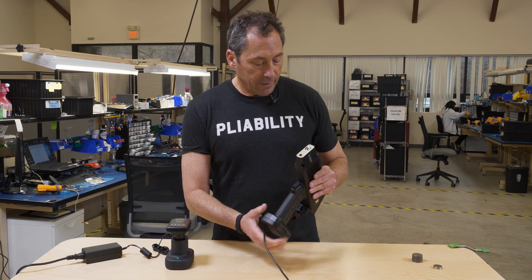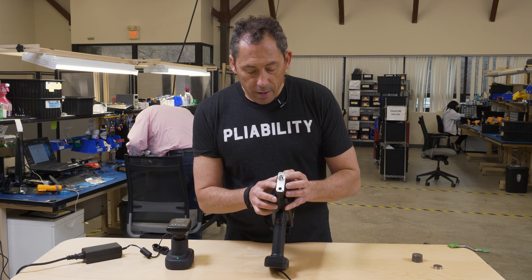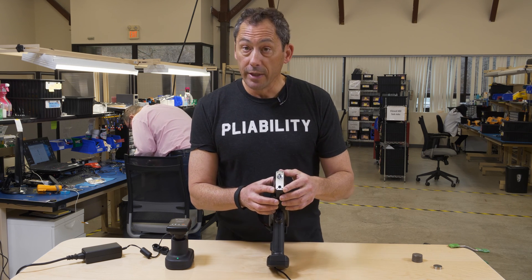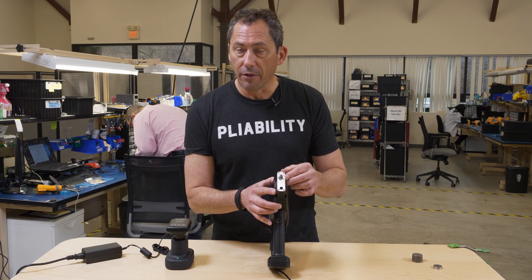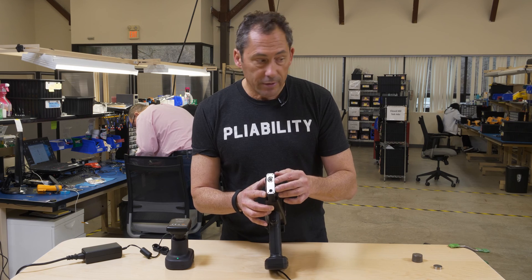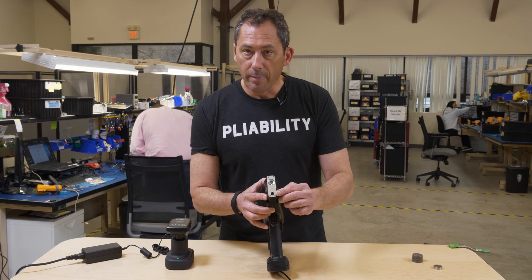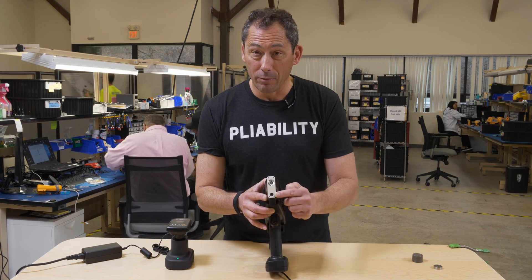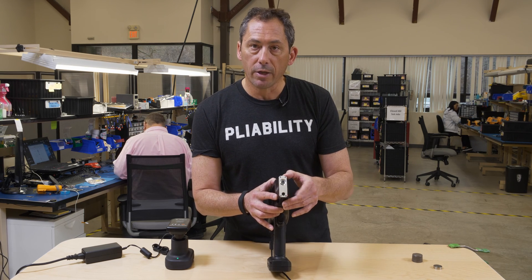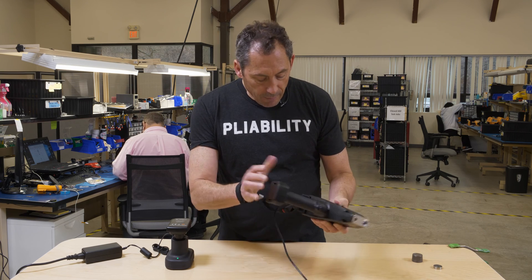This is the front of the nose. The window — if you break the ProLine window, you pop off this plate and replace it. If you're doing in-service PMI at very high temperatures, there's a thin Kapton window that comes with it. The analyzer has two cameras: an internal camera for looking at samples and welds, and a macro camera more like a cell phone camera which you can use to take pictures of surrounding materials. It'll even read a barcode.